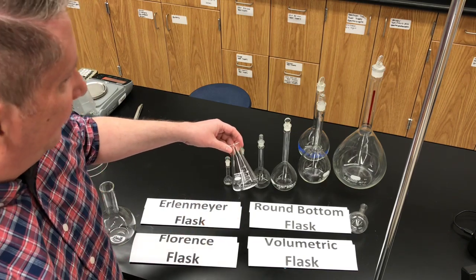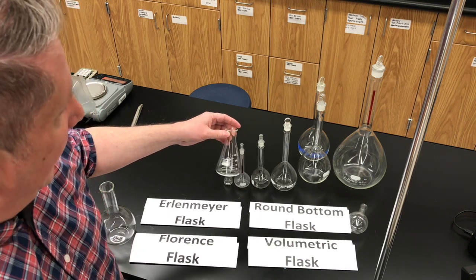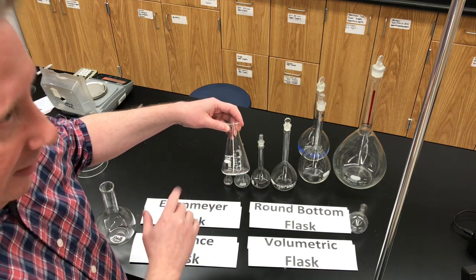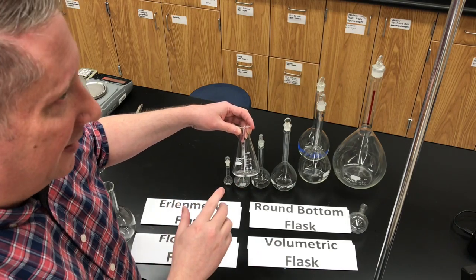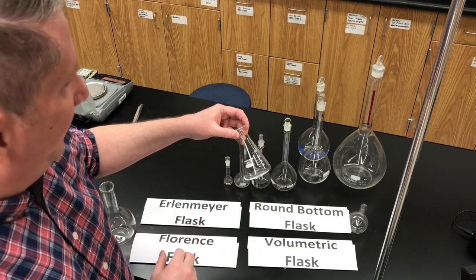It's sometimes called a conical flask, or a titration flask, where we use a particular lab in grade 12 chemistry. It's got calibrations for measuring different volumes, but like beakers, the volumes are not accurate measurements. These are very rough estimates of the volume in the flask, so you would never use this flask to measure something accurately.